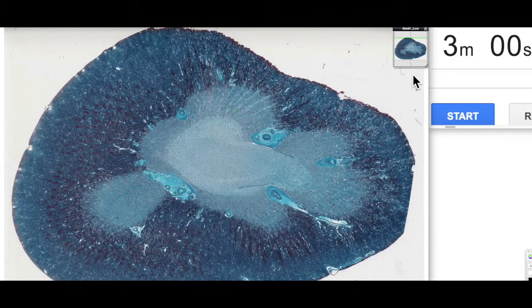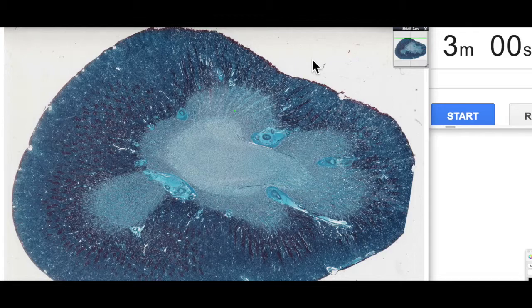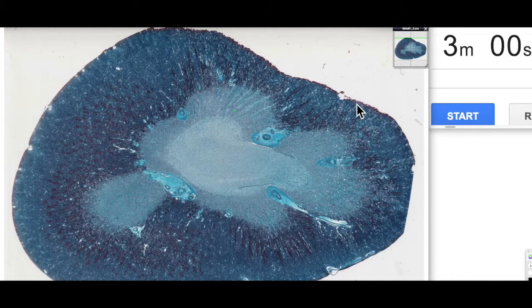This big blue blob here is actually a section of the kidney. Out here is the outer cortex, this is the medulla, a couple of parts of the medulla. We're going to focus on this part here. So let's start our three minutes.